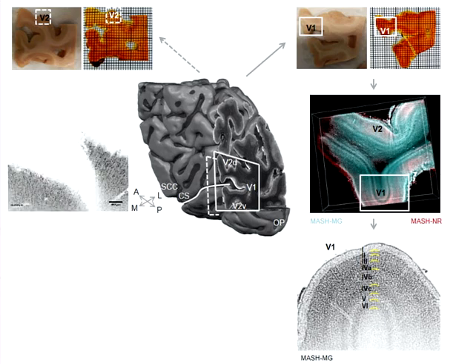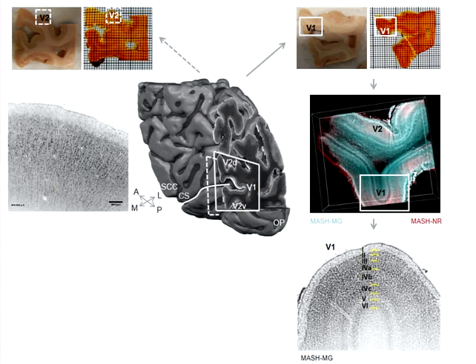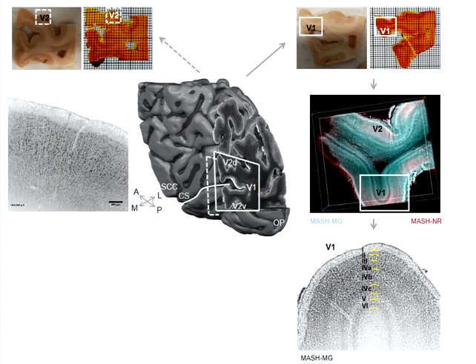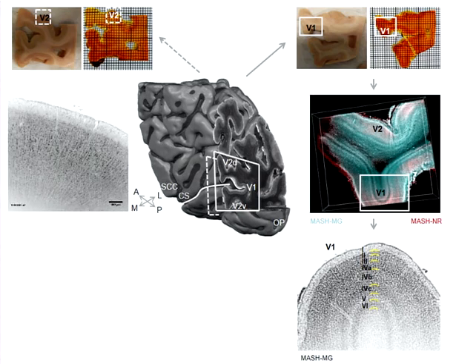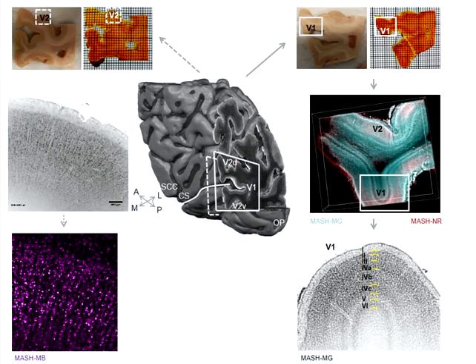Just to show you that that is actually in the context of an entire 3D stack, I will keep this running in the background here, and you can see that we can get cytoarchitecture at cellular resolution very deep into the tissue. Zooming in a little bit into the field of view that I just marked in the previous slide, if my slide wants to advance, there we go, you can see that we can go in a bit further.